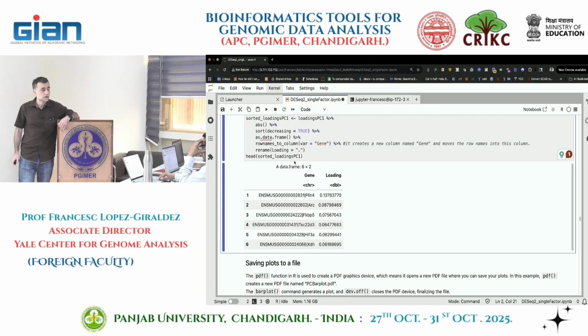So DBL here is the log 2 fold change, the last column? No. It's the loadings. Again, our analysis has been done. Now we are just playing with, remember, we transformed our data, and then we did the PCA. PCA is just its own analysis. It's not related to fold changes. There are no p-values, nothing. This is just the loadings of every gene. So PC1 is a linear combination of every gene, with a loading associated to every gene.